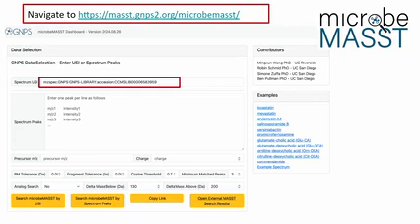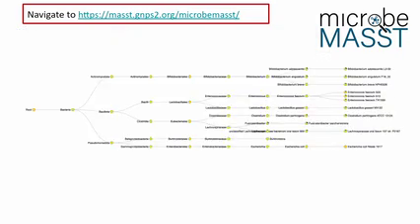But if you're working with very small molecules whose MS/MS spectrum doesn't have a lot of peaks, then it doesn't make sense to go to 5 to 10, so you have to keep it low. And then you have to do the manual inspection to see if it's a good match or not. I would recommend knowing how your molecule is fragmenting to make sure that the results make sense.